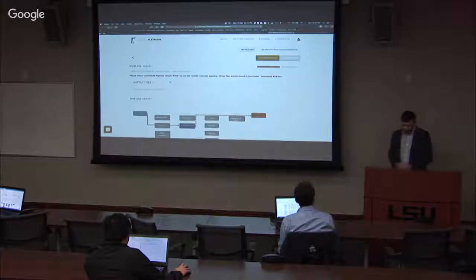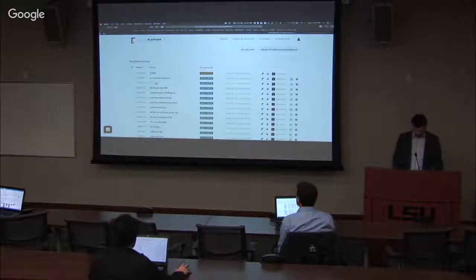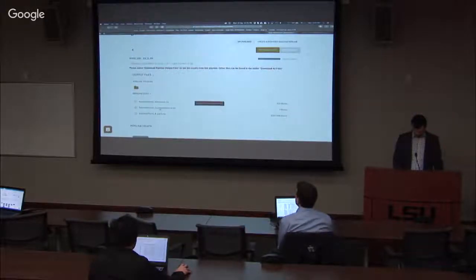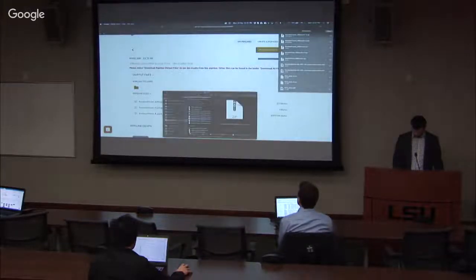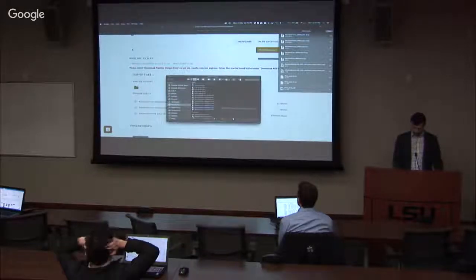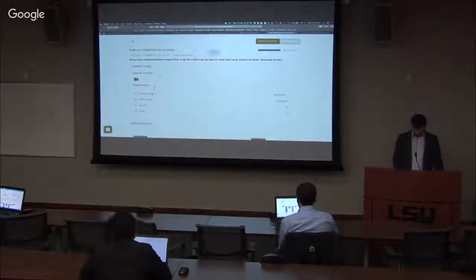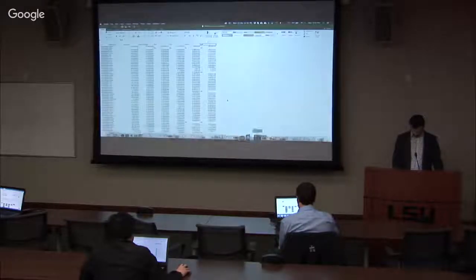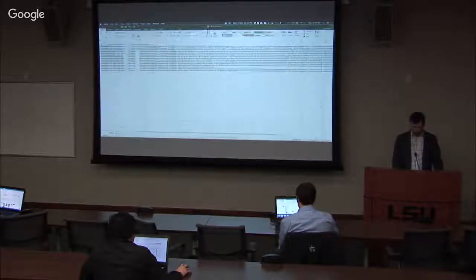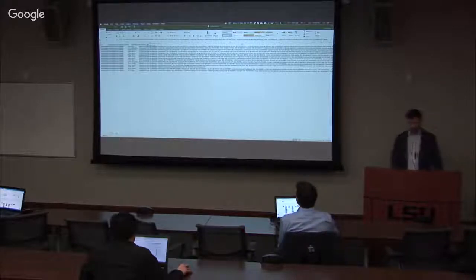Okay, so unfortunately our time ran out. Let's just take a look before we finish at the results of these two pipelines. That didn't work again. I've got to look at my table again and see what's wrong with that one. So let's just check on the annotation. So here's the result from the annotation, just what it looks like. Here you can see for each gene, the common name, gene symbol, and then you have description of each gene and the gene ontology. So multiple gene ontology domains.